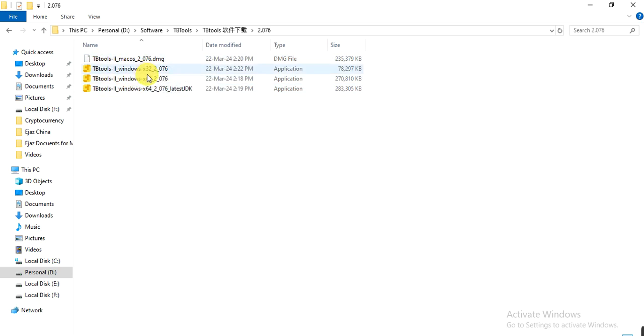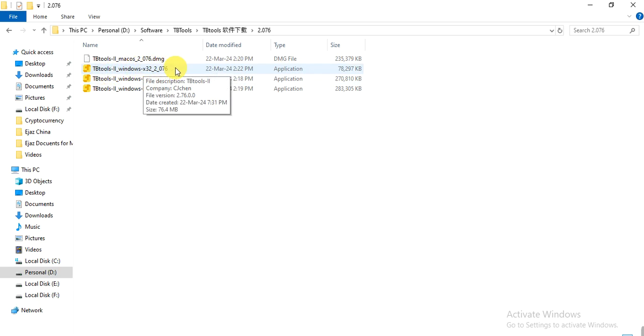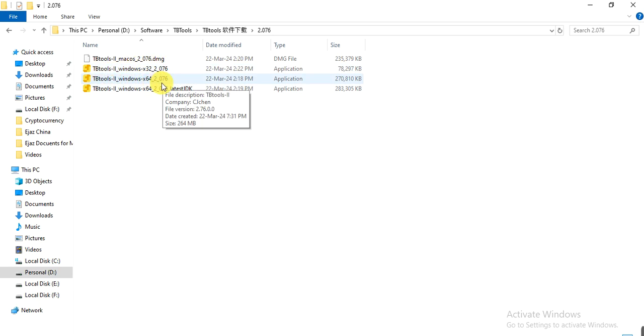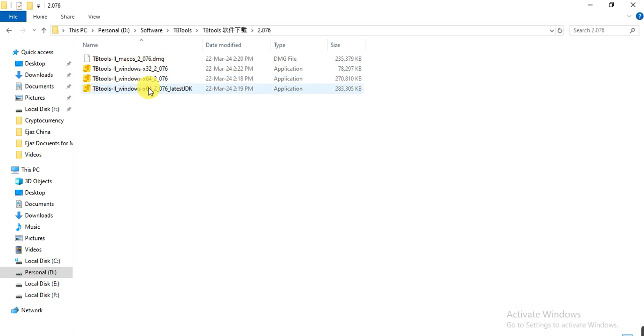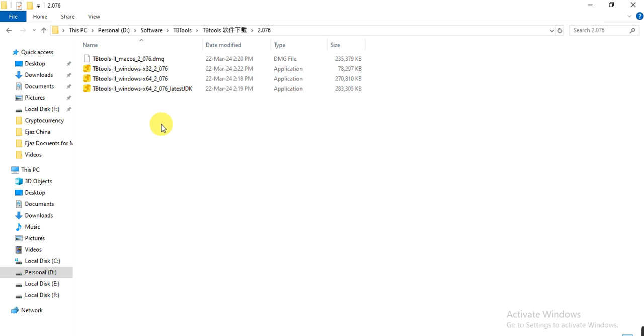There are different software versions for different Windows. If you are using 32-bit Windows, you can install this application. If you are using 64-bit, you can install any of these two. If you are using MacBook, you can install that one. I am using 64-bit, so I will install this one.